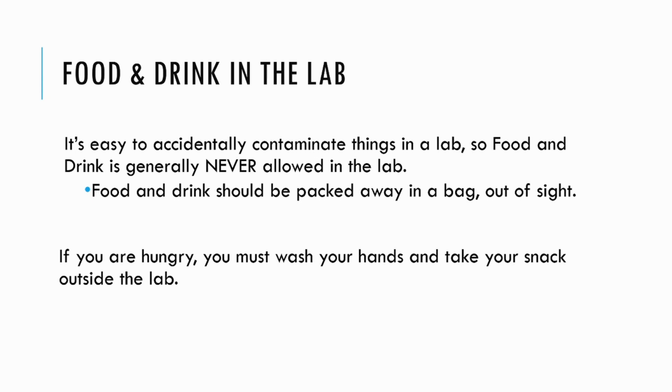Food and drink in the lab. It's really easy to accidentally contaminate things in a lab. It's easy to accidentally touch things that we shouldn't have touched and then go back and touch other things that we shouldn't have touched. So food and drink is generally never allowed. If you do have food or drink, you should pack it away in your bag and keep it out of sight. Really try to avoid something that cannot seal. So things like a Starbucks cup that has a straw wouldn't be a good thing to bring into the lab since you can't actually seal it and properly pack it away.